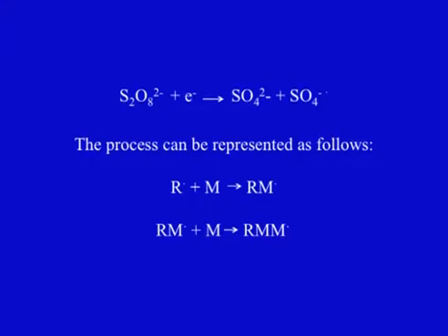If we look here on the screen, you have a persulfate ion, and it is decomposed into a species with a single unpaired electron. So, a free radical is generated. Now, if M is the acrylamide monomer and R is the free radical, it is a kind of chain reaction which leads to the formation of cross linking in a head to tail manner. It goes on, and in between bisacrylamide is introduced.